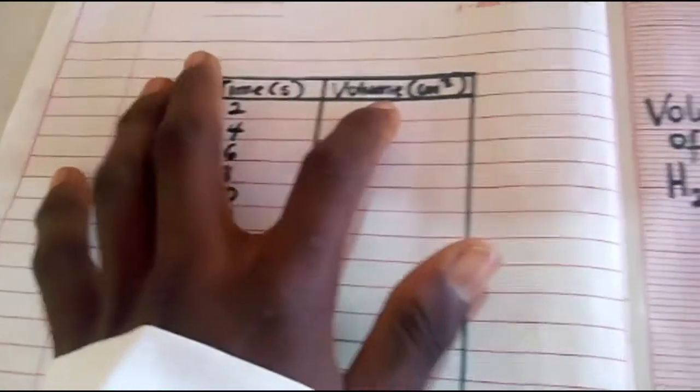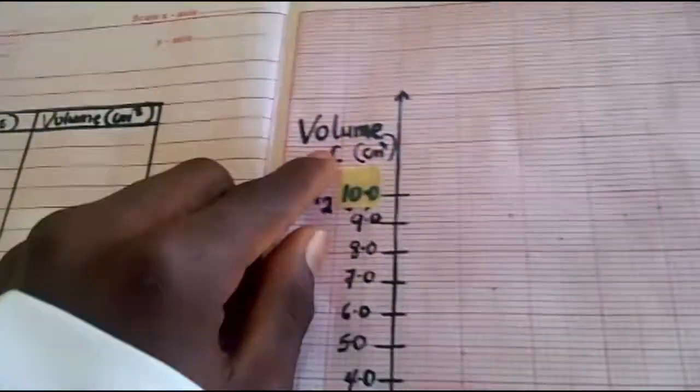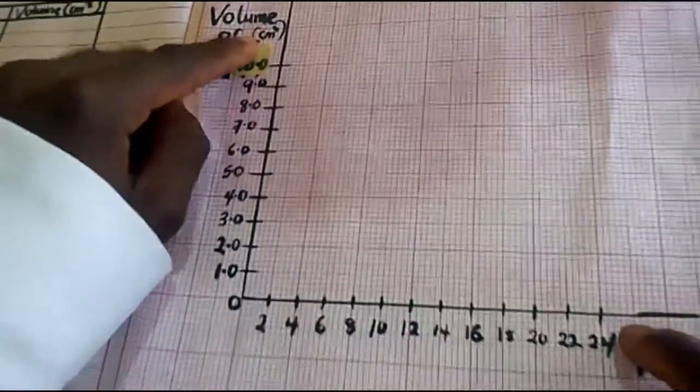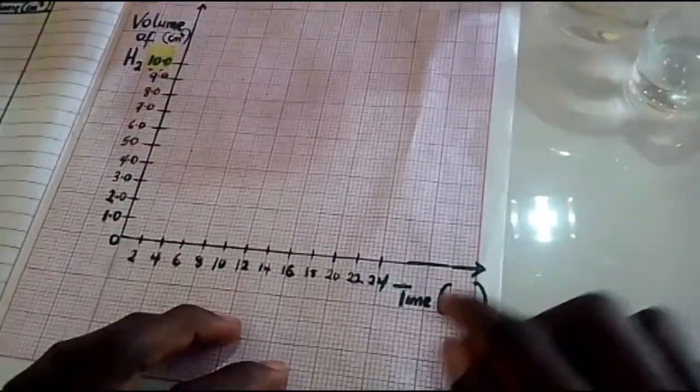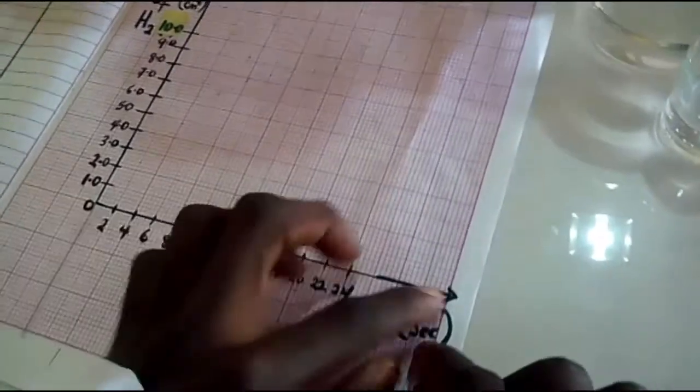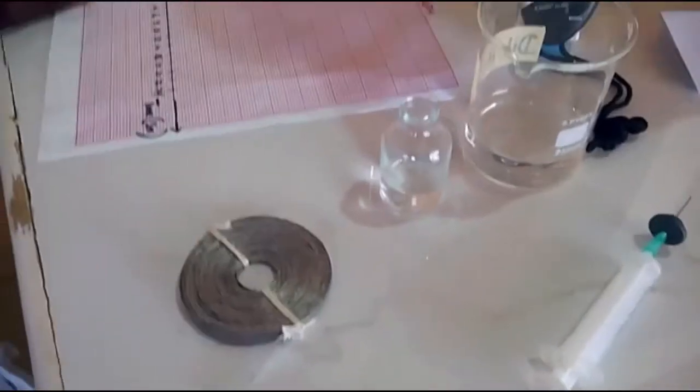Before step 3, we need to draw our table of values and get our graph ready. Here, time is in seconds while volume is in centimeter cube. While here, volume is in centimeter cubes and it is on the vertical axis, while time is in seconds and it is on the horizontal axis.